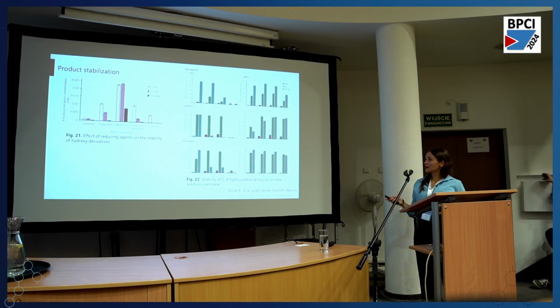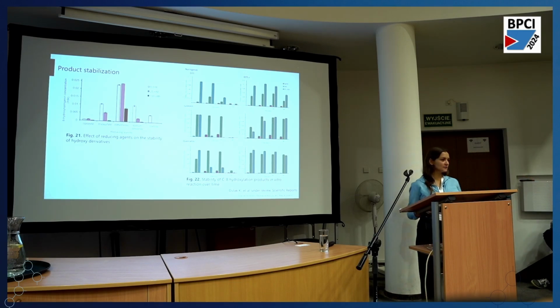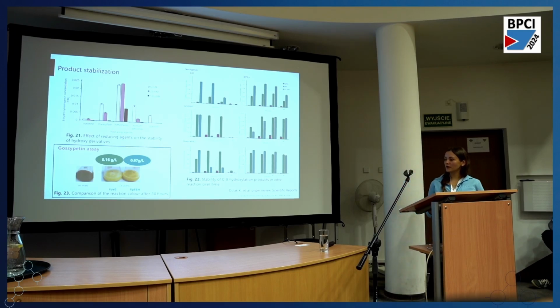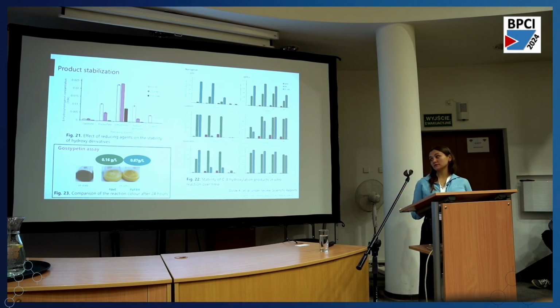So we ran the test using 3 different substrates, with and without DTT addition. After 1 hour, we were not able to detect the product without DTT, but with DTT, the product was still visible. As a proof of concept, we decided to run a 24-hour reaction using quercetin. And for this one, using FDEE we were able to produce 0.16 and with PPF8H 0.67 grams per liter of gossypetin. So that confirmed that the approach worked quite nicely.